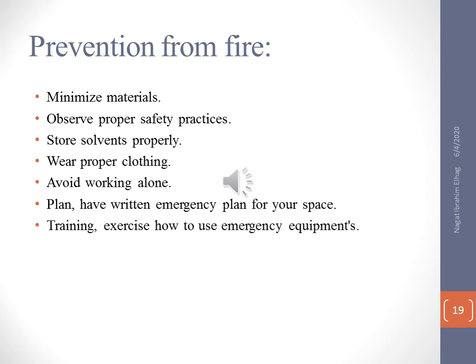Also, one of the steps is to wear proper clothes, because when you are in the lab, you have to know that your clothes must not burn easily, so you have to choose clothes that do not burn easily if an accident occurs in the lab.